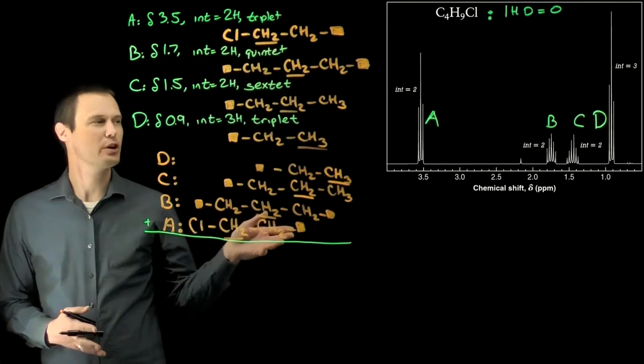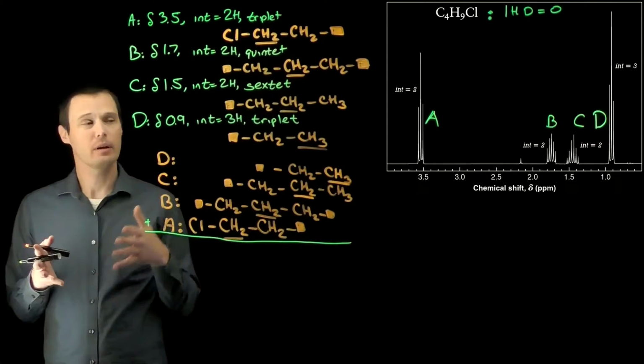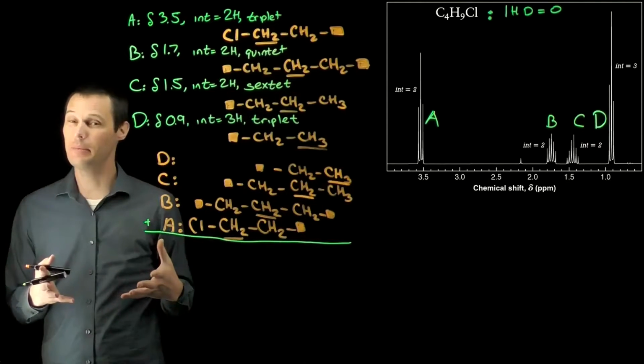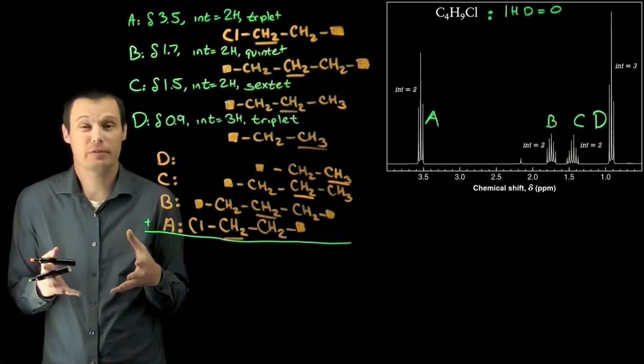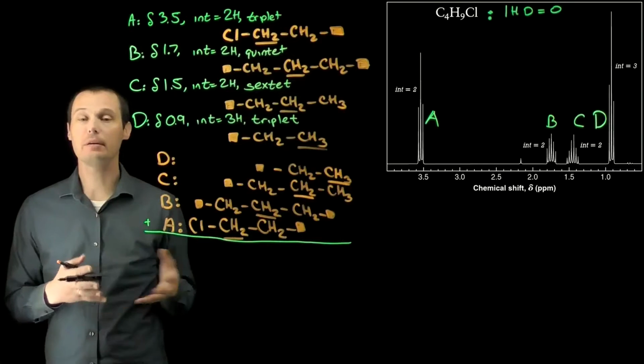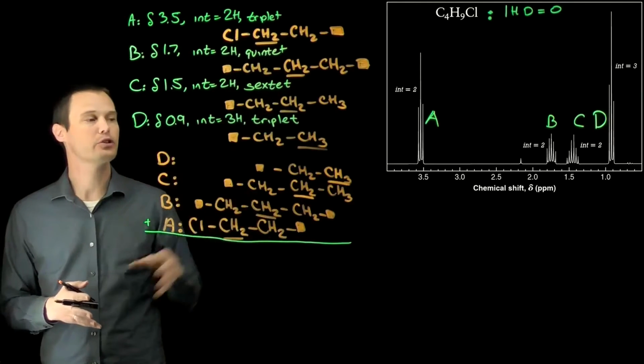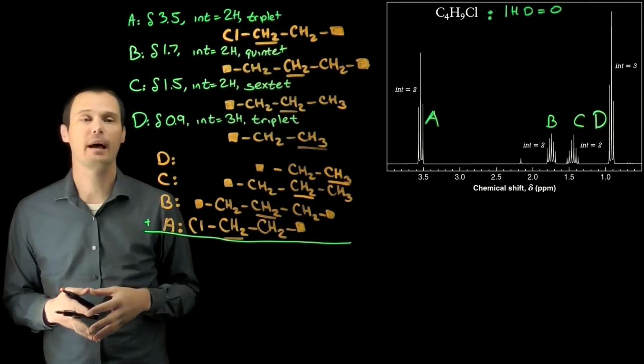The assessment asks us to predict a structure for this NMR spectrum. Doing so from the beginning with all of the steps involved would probably make this about a 15-minute video. So in the interest of time, I've already done a lot of the work. If you're confused about what I'm going to talk about here, I encourage you to go back to that section of the book and talk with your instructor to get more information on how to do these steps, but I'm going to cover the highlights here.